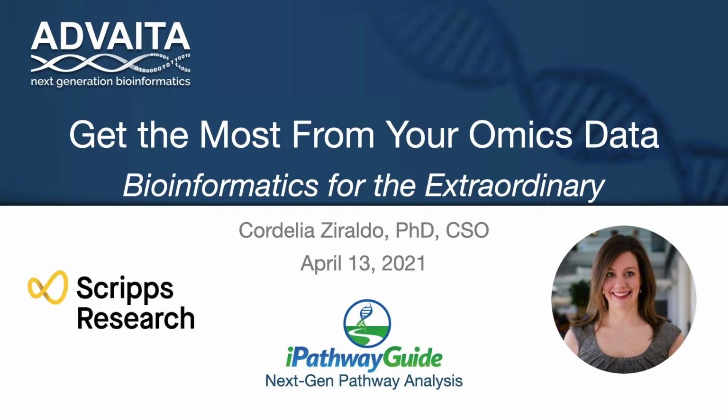In the first webinar held last Tuesday, Cordelia focused on the overview of iPathwayGuide, the pathway analysis software. This is their flagship product, and we learned about the importance of having an up-to-date knowledge base in the interpretation of your omics data.